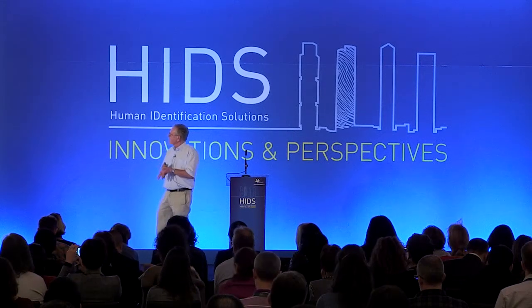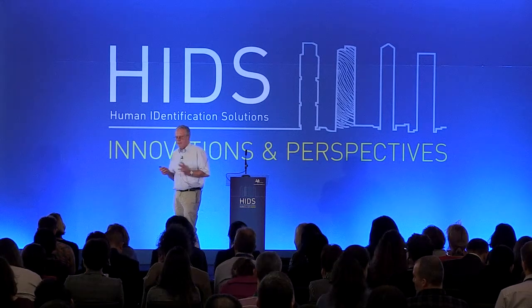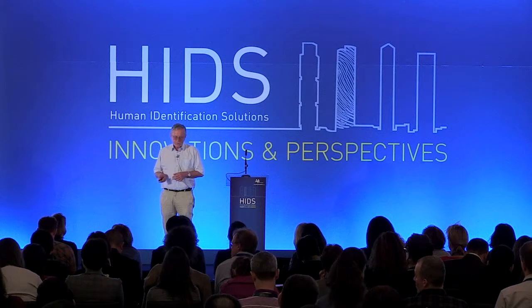We work with an experimental kit from Life Technologies with 9 STRs and amelogenin. And I got a lot of experience with this.